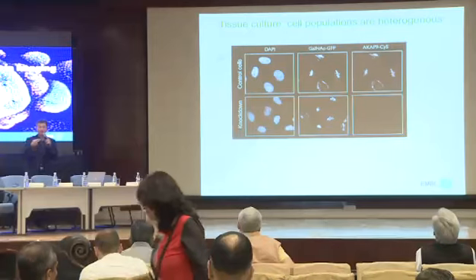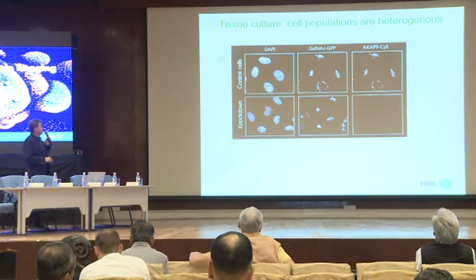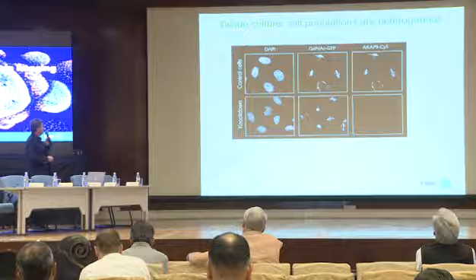Here you can see control cells, this is the target gene that we are looking at, and this is our marker, a Golgi marker. You see that the structure is quite Golgi-like, except in some of the cells. This is eventually a cell before mitosis, and it shows something different from the normal. But when we do a knockdown of this particular gene, you can see that in virtually all of the cells the protein is completely gone, yet some of the cells are not showing a phenotype, and some of them are showing the phenotype.